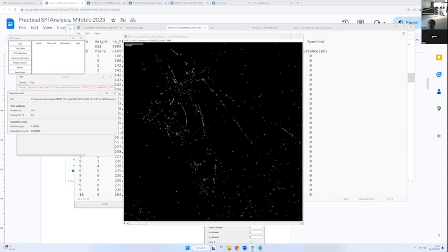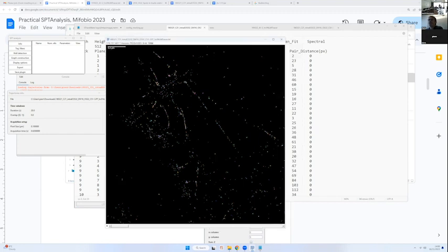Okay, so once you do this, good, and you choose the file and set load. The file is 180321 C21 intra EOS 32 blah blah blah. Okay, I think we're good.